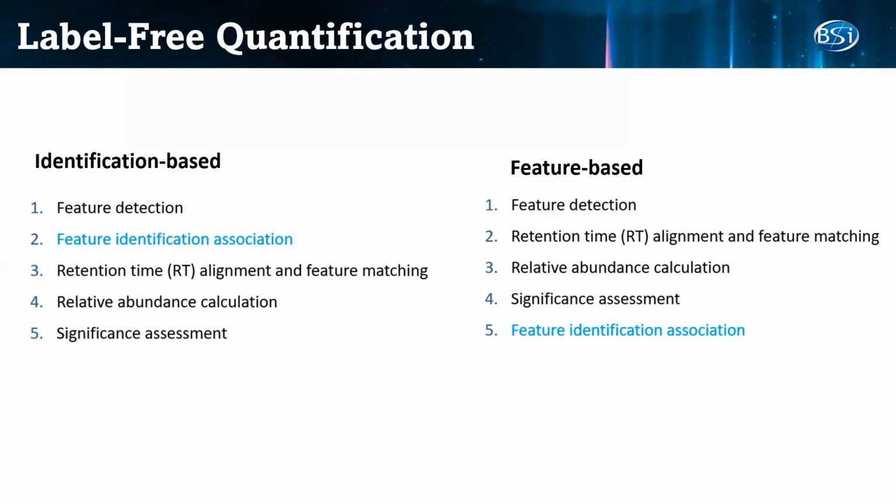In PEAKS 12, users can choose between an identification-based or feature-based algorithm for LFQ. Let's look at the identification-driven algorithm first.